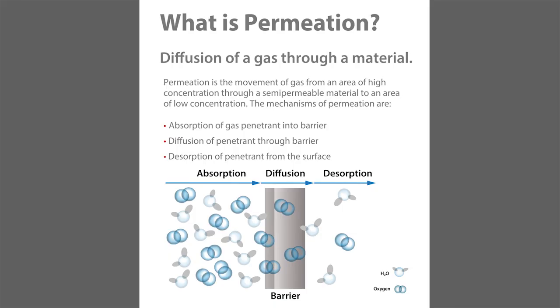So what is permeation is a question that we get. We're measuring transmission rates all the time. It's what our core instrument does. And kind of simply stated, I think the schematic does a nice job, it's a three-step process. We'll have a gas. It's usually a test gas. It could be oxygen, water vapor, CO2. We've got a barrier material.